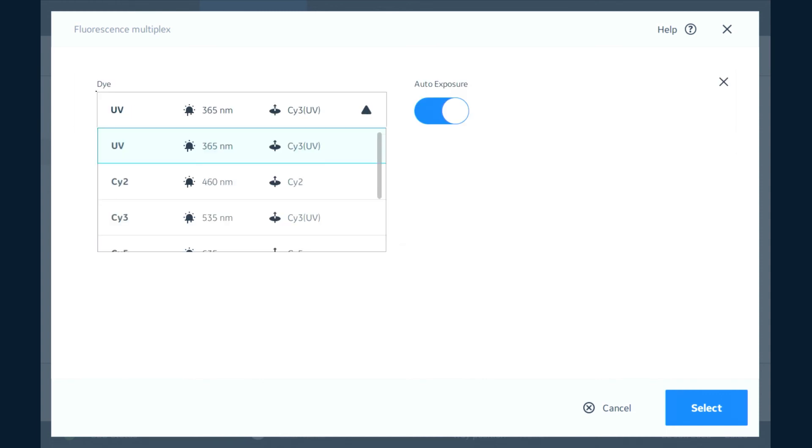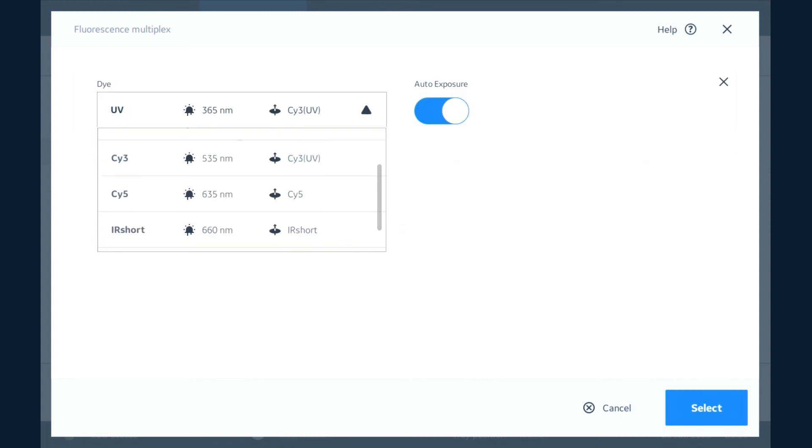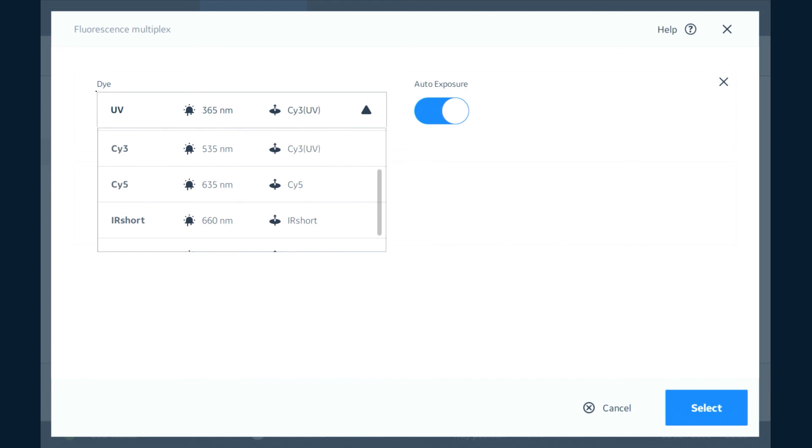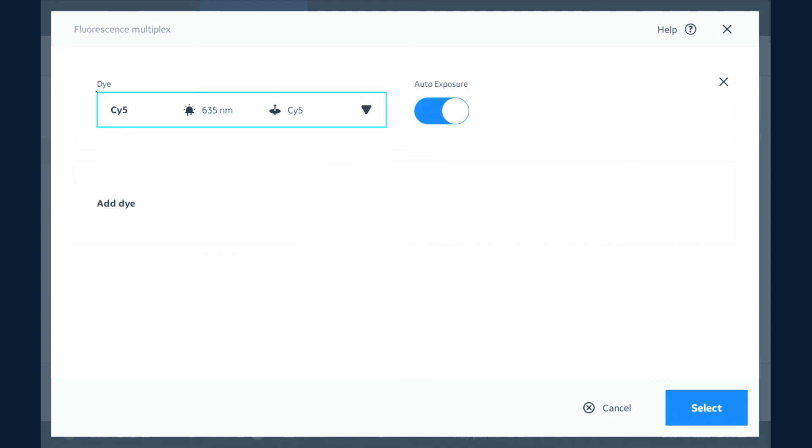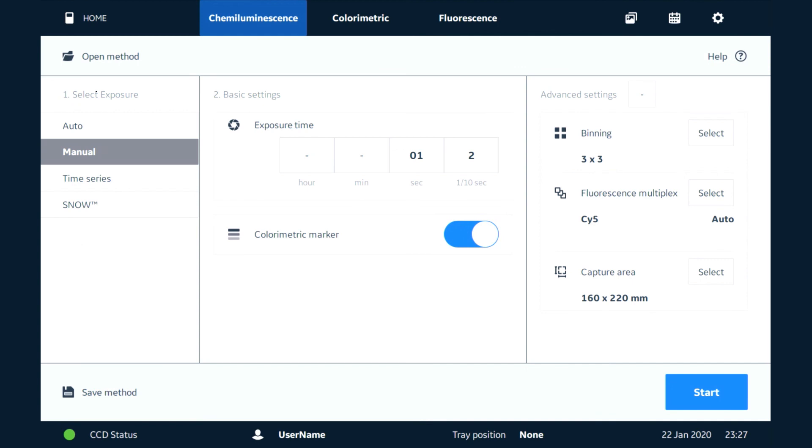We have a list here of appropriate dyes. We're going to choose Cy5 for our Quickstain here. We're going to use auto exposure here. We'd select that and be able to do a multiplex image.